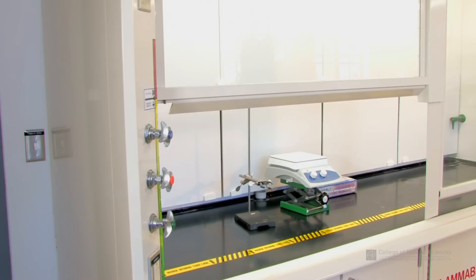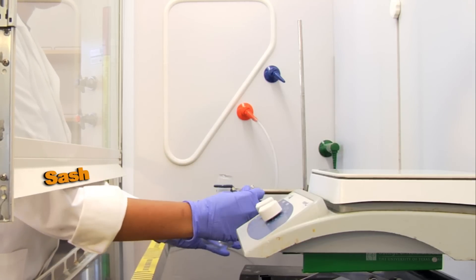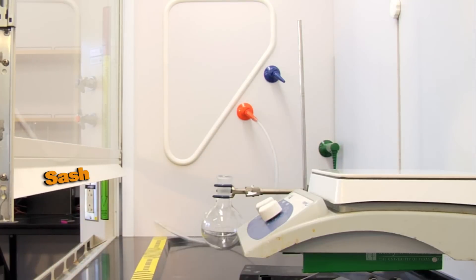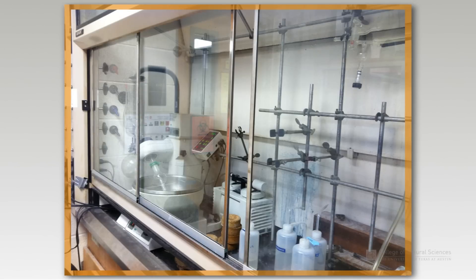Secondly, keep the sash as low as safely possible when working. This will minimize potential exposure to chemicals and protect you in the event of a spill or fire. If a combination sash is installed, do not open the vertical and horizontal sashes simultaneously.